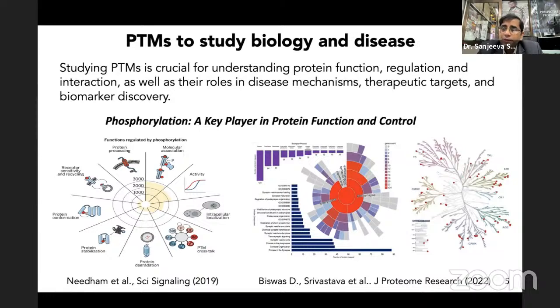Sample enrichment using different types of IMAC columns and titanium dioxide based technologies to enrich the phosphopeptides, followed by running them in very sensitive mass spectrometers and acquiring all types of phosphorylated proteins, or the phosphomap of the proteome, is another thing which is emerging very heavily.